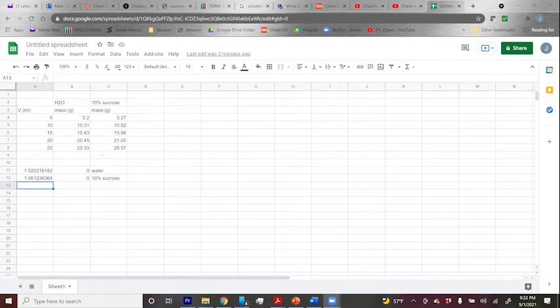Sorry to interrupt. Oh, go ahead, no problem. For my sugars, they don't have to be exactly 5.5, like I got one that's 5.51. Oh my God, get out of my class, 5.51. Just get out, I can't even bear to look at you.